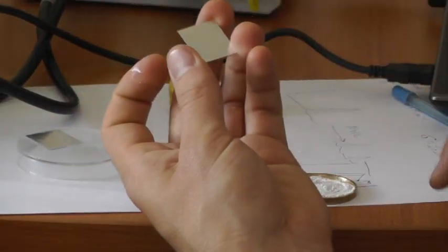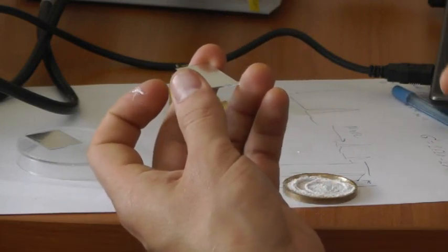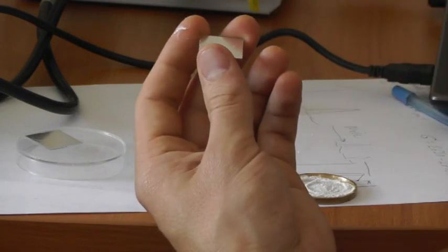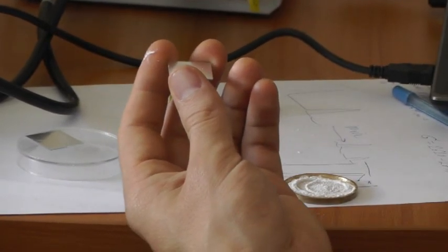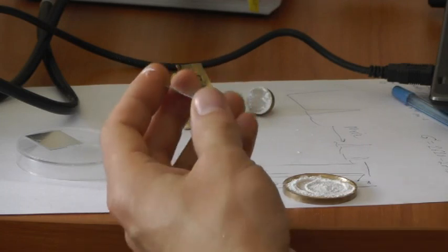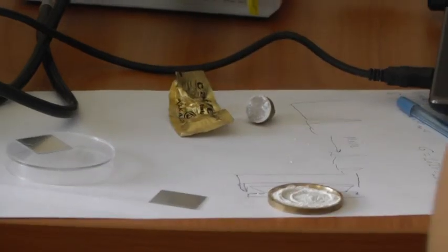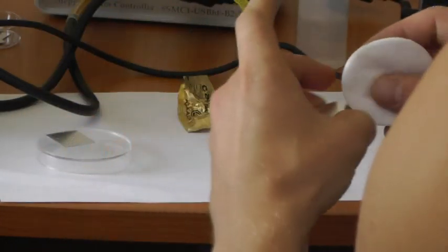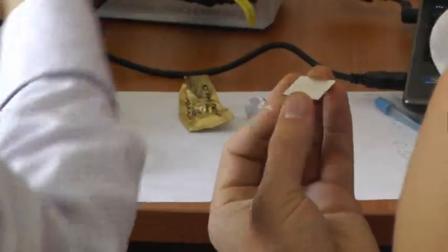This surface has been wiped with ethanol, just to remove any organic particles, and probably dyes and fat. Or we can do it once again, just to show you. I take a cotton disc, then wipe it.